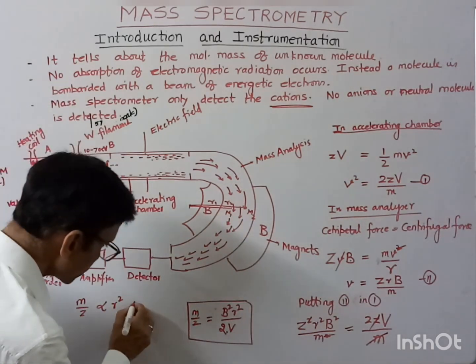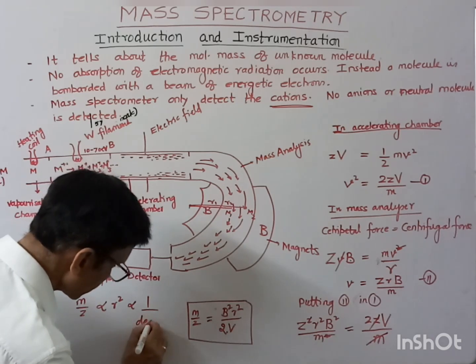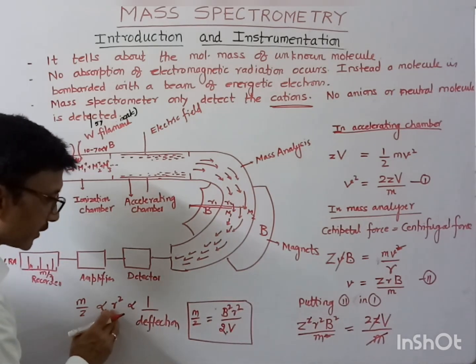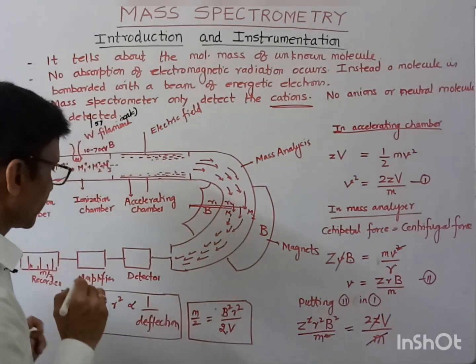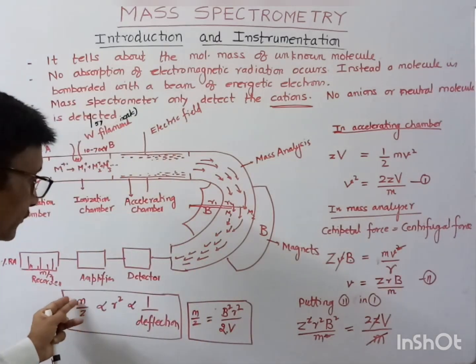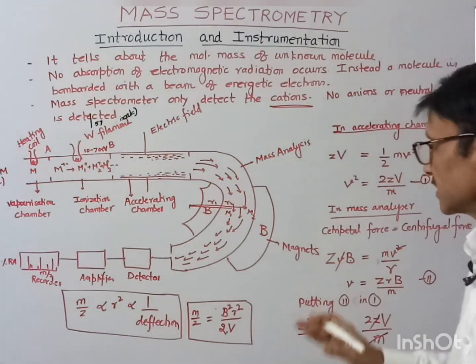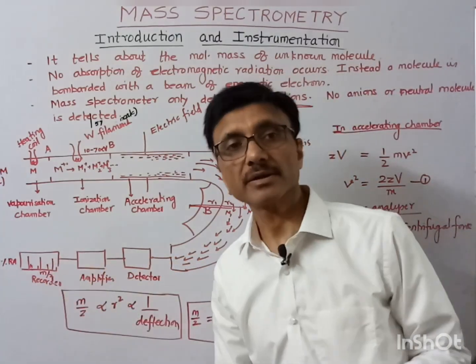So by this relation, according to the mass, we may see the deflection, meaning which fragment will reach the mass analyzer late and which will reach earlier.